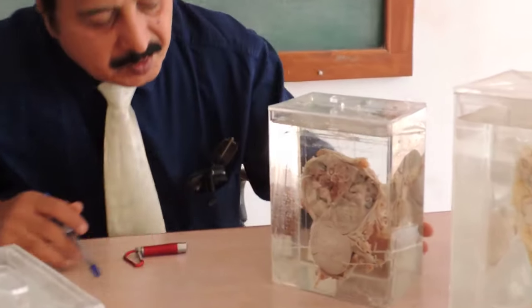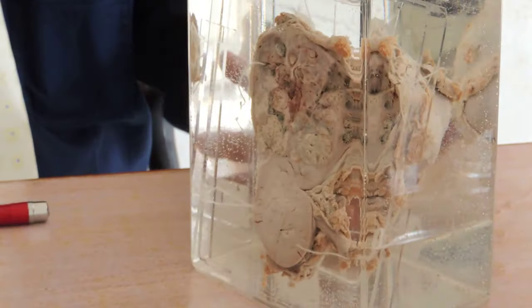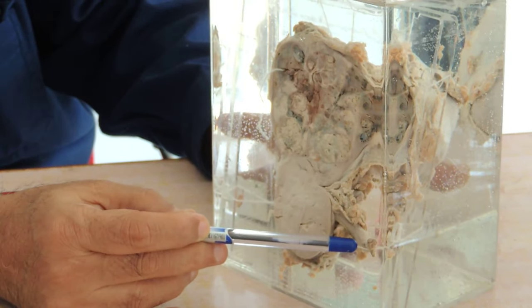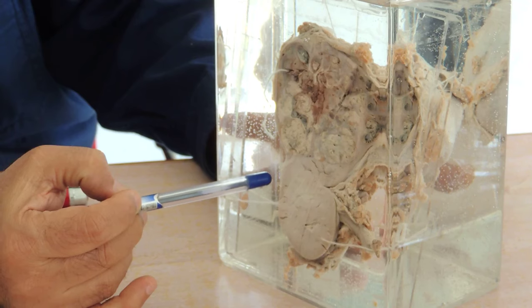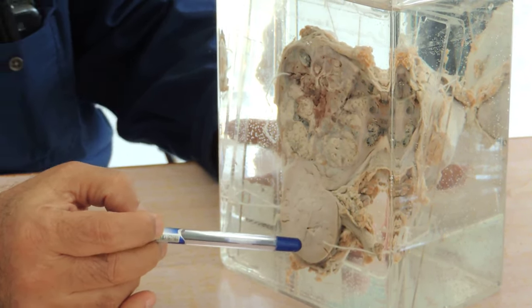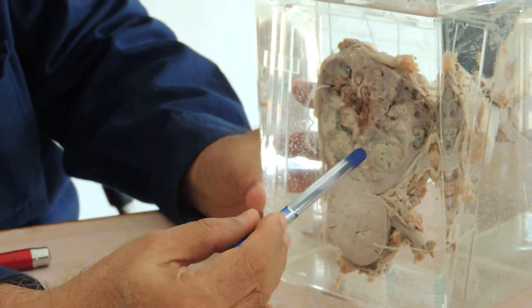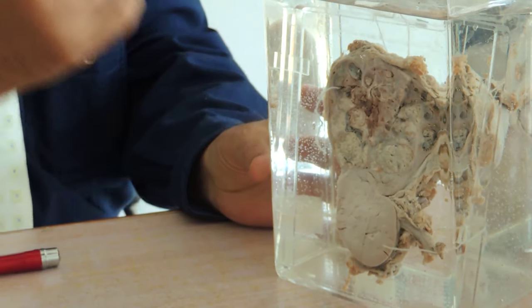Look at the specimen from the cut surface and from the capsular aspect. Have you seen this? Yes. So now you can identify the organ as the kidney, as a part of the ureter is seen, and the lower one third shows normal appearing renal parenchyma or renal tissue, the lower pole of the kidney. Now the upper portion or the upper pole of the kidney shows a tumor which is about 8 by 7 by 6 centimeters.